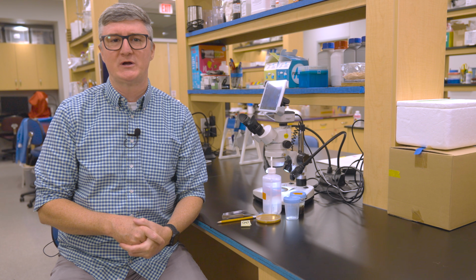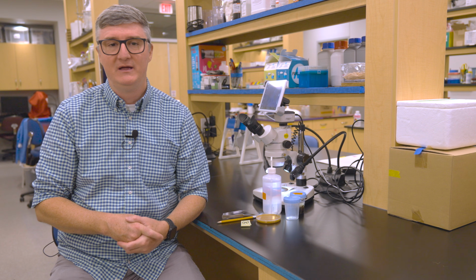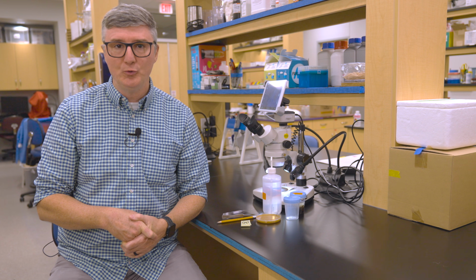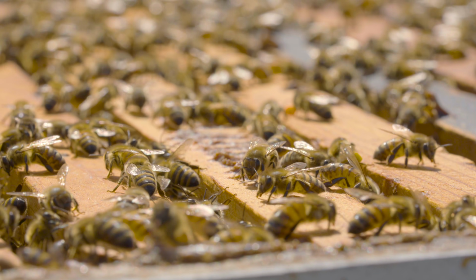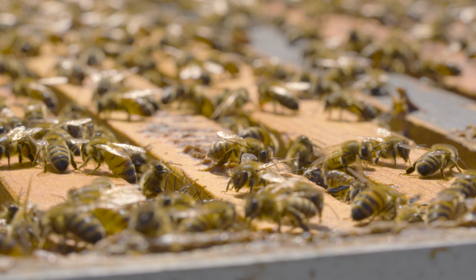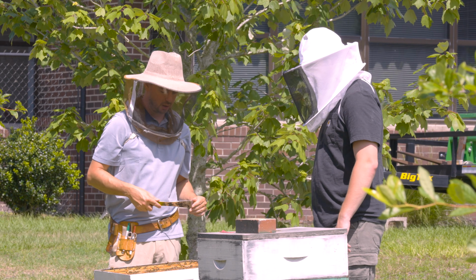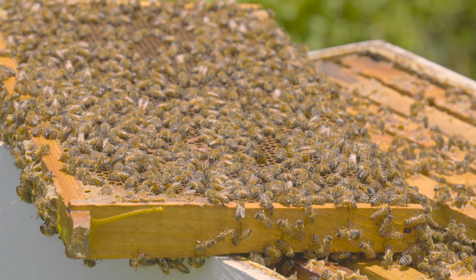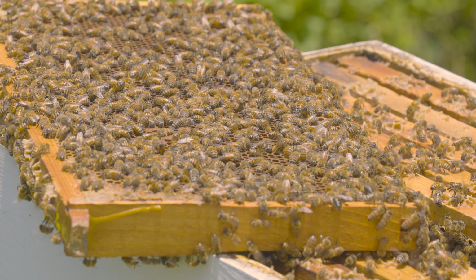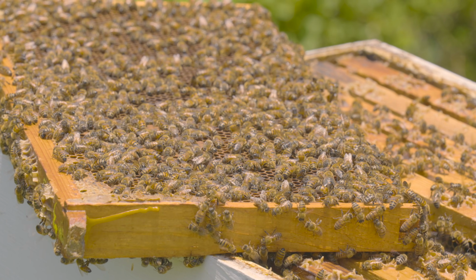Usually when I want bees for tracheal mite dissection purposes, I'll actually go into the hive, keeping in mind that older bees tend to hang out on the outer frames or the uppermost boxes of the hive rather than in those center frames of the brood nest. So I would go down to the brood nest probably, and from the outer frames of that box, I would collect adult bees. Doing that ensures that you're getting bees that are more likely to have tracheal mites.